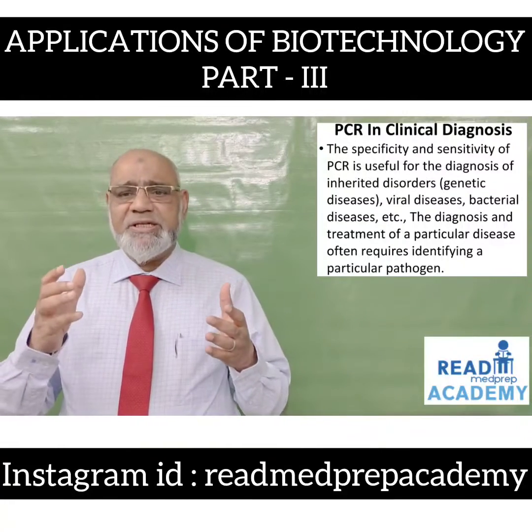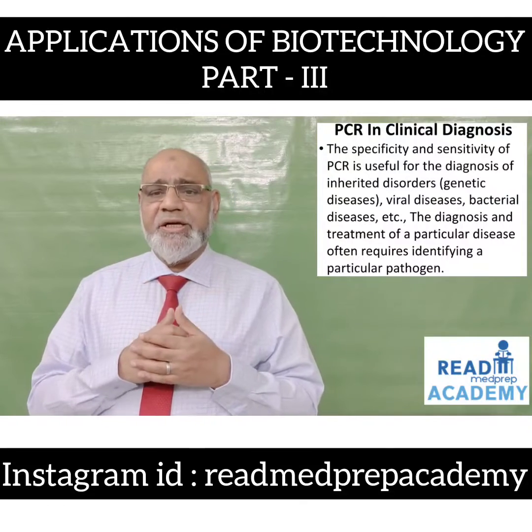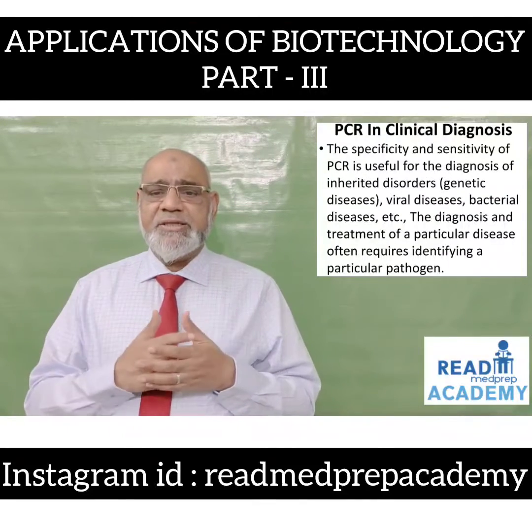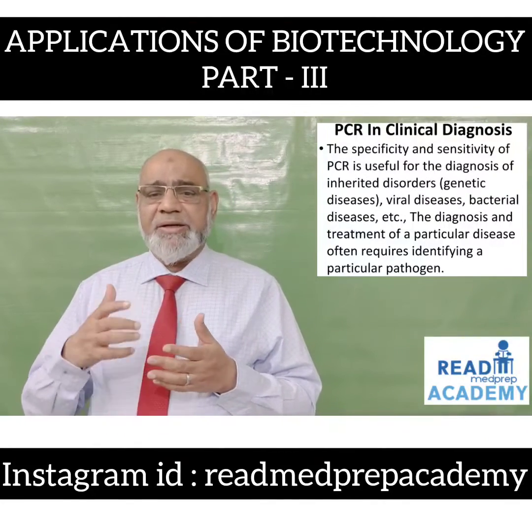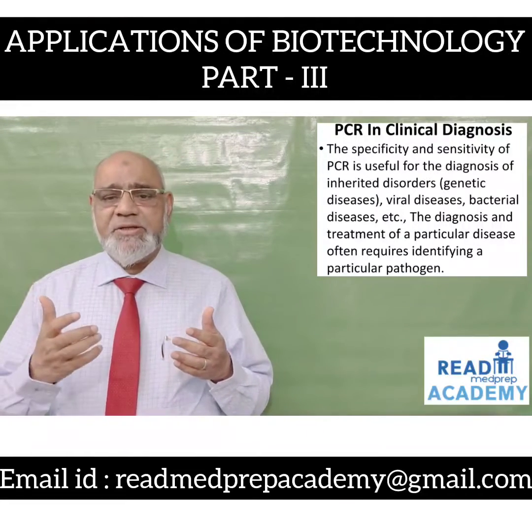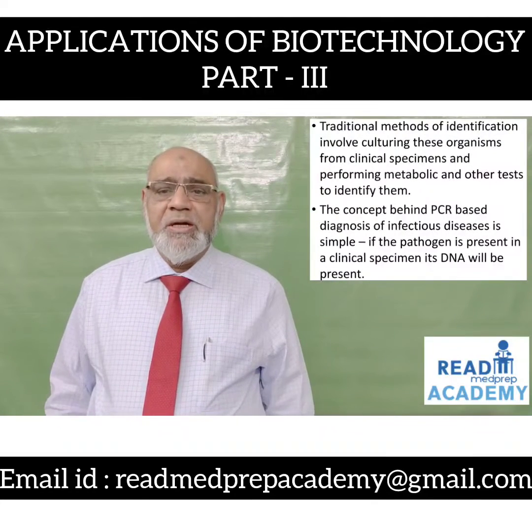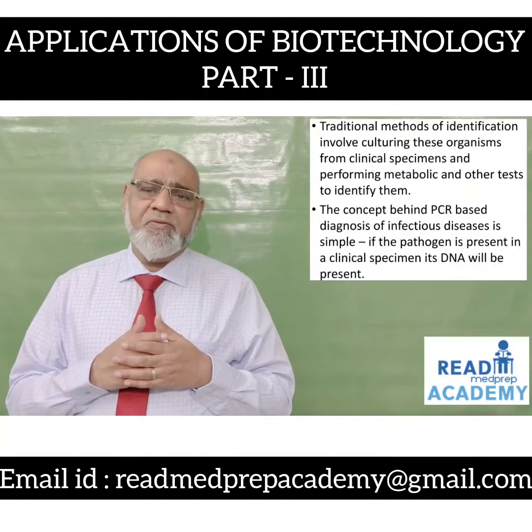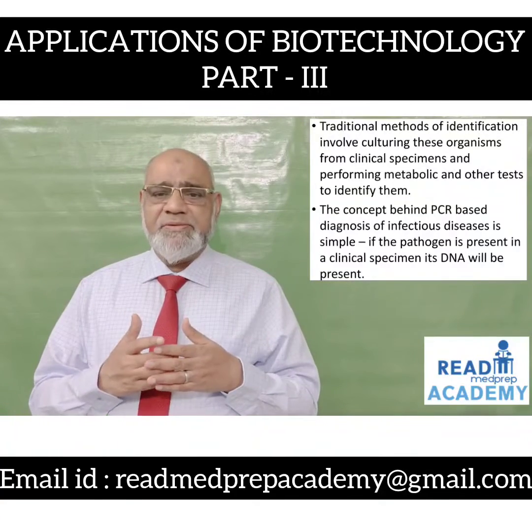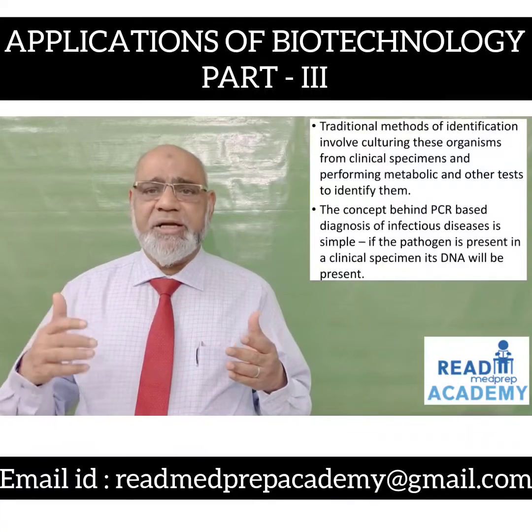The specificity and sensitivity of PCR is useful for the diagnosis of inherited disorders, genetic diseases, viral diseases, bacterial diseases, etc. So, the diagnosis and treatment of a particular disease often requires identifying a particular pathogen. Traditional methods of identification involve culturing these organisms from clinical specimens and performing metabolic and other tests to identify them.